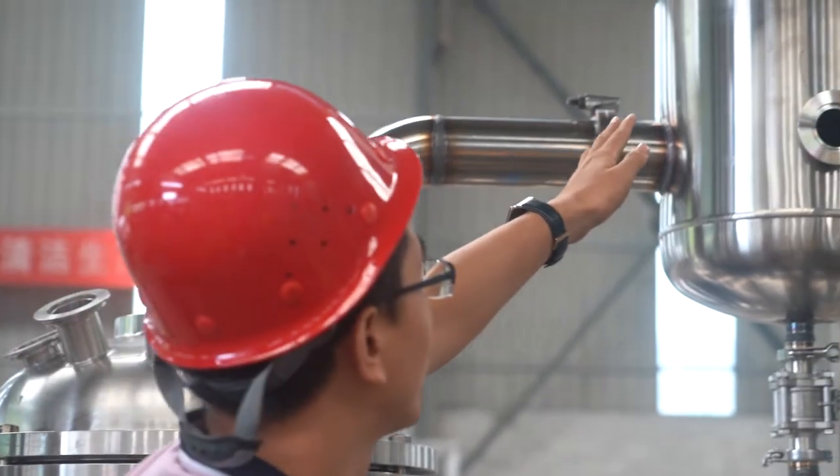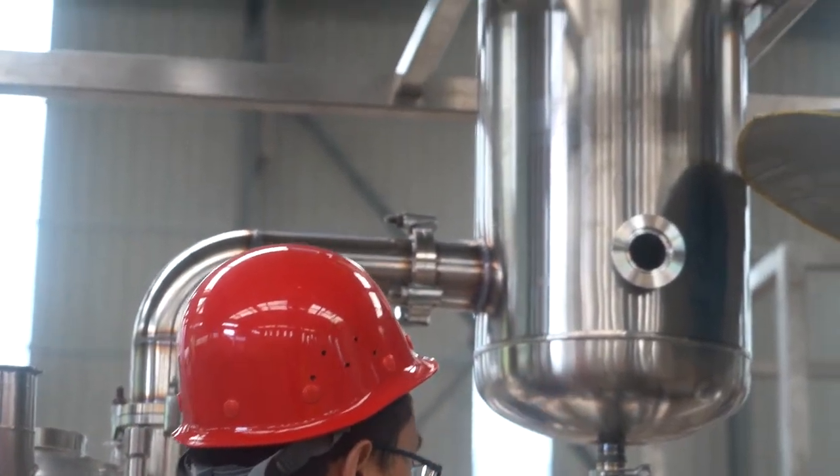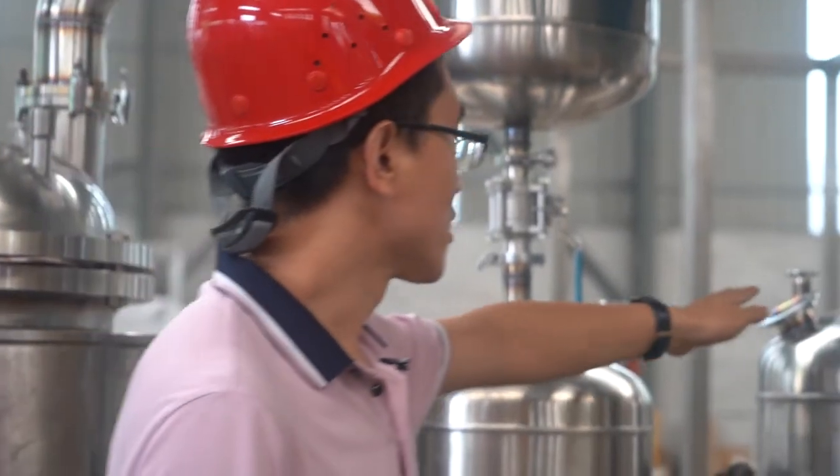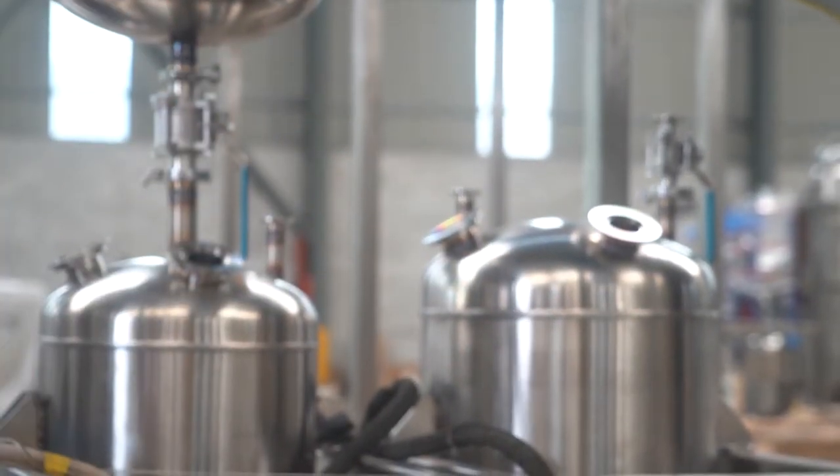This one is a big condenser. This one is a collector tank. This is a big collector tank.